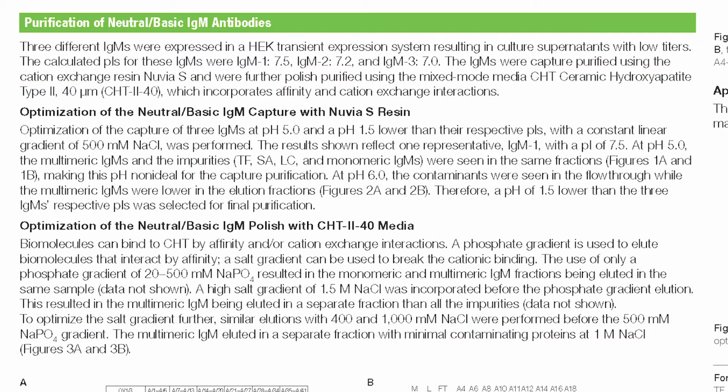And next to IgM molecules, this purification platform is also relevant for other antibody-derived proteins like IgG fragments, single-chain FV fragments, also nanobodies and diabodies. So in general, this presented platform can be applied to a variety of molecules.